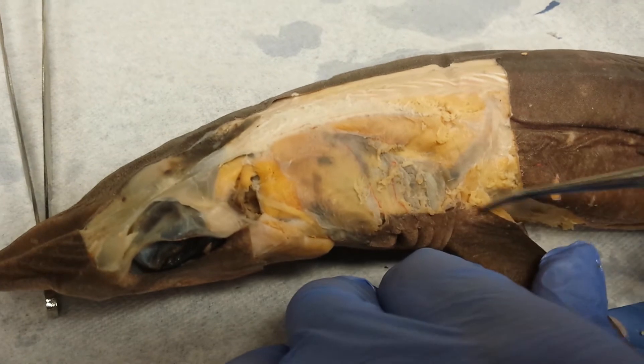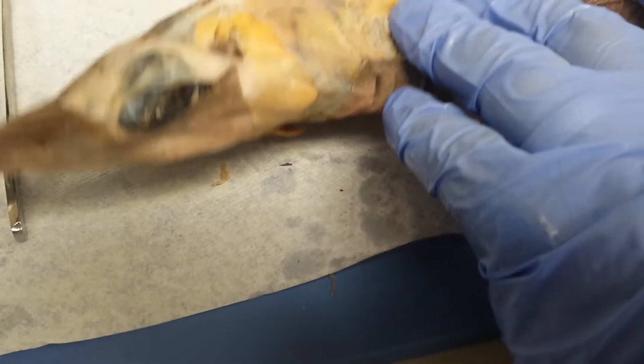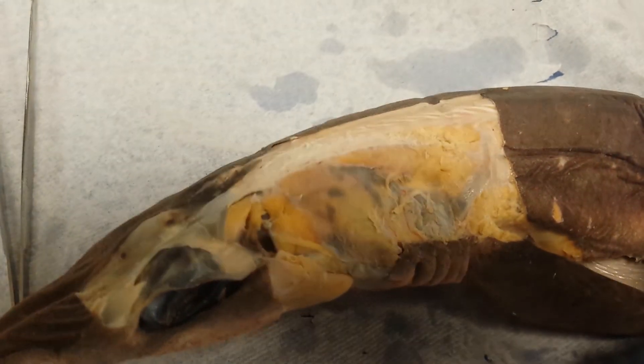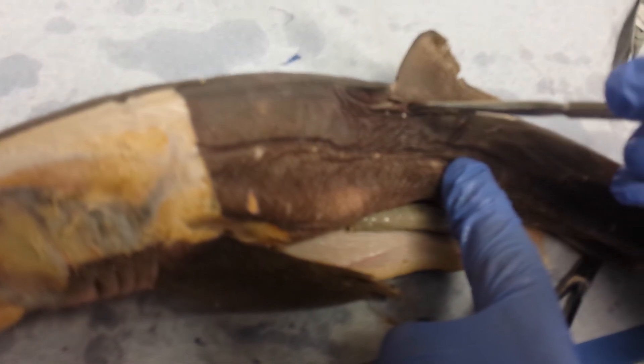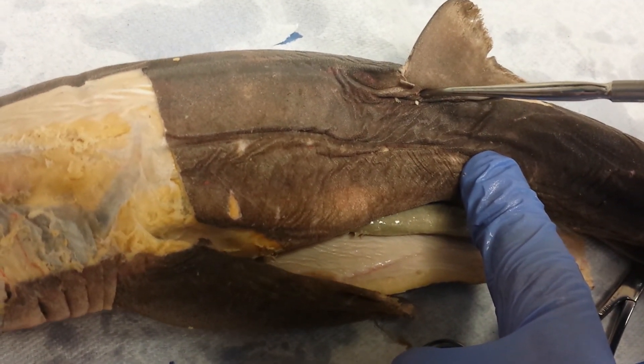Then I have, on top of the gills, the levator. And then if you were to remove the skin here, you'd see the radial. Focus at the top — the skin right here, you'd see the levator and the radial of the dorsal fin. That's it.